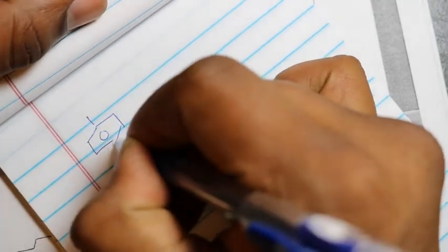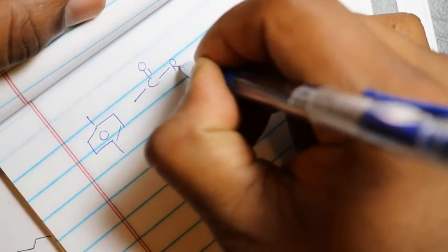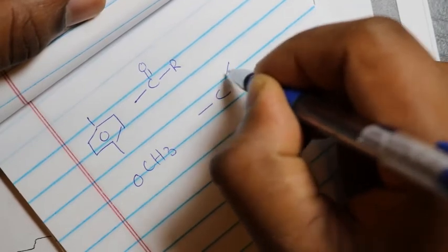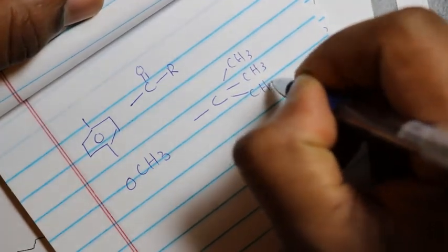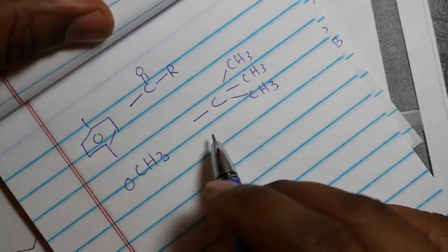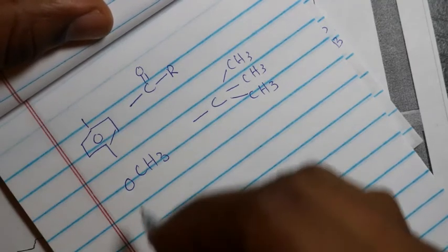Now let's try to put all the fragments together. We have a benzene ring 1,4 disubstituted, and we have a ketone, and we have a methoxy, and we have a tertiary butyl group. So the possible structure is this.